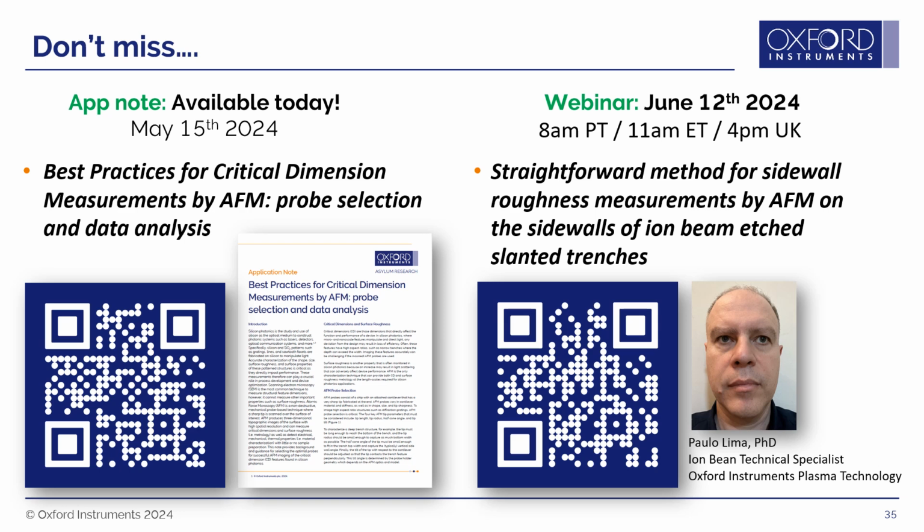We have a few questions about imaging mode. What imaging mode was used to acquire the images in the presentation? All the data that you've seen in the presentation, all the images, were acquired in tapping mode, an intermittent contact mode.